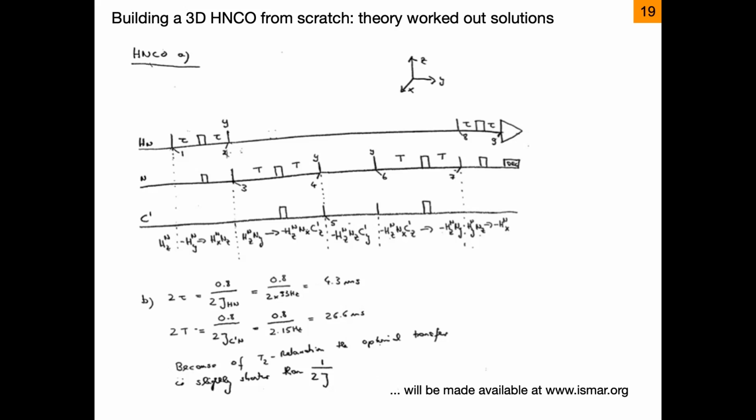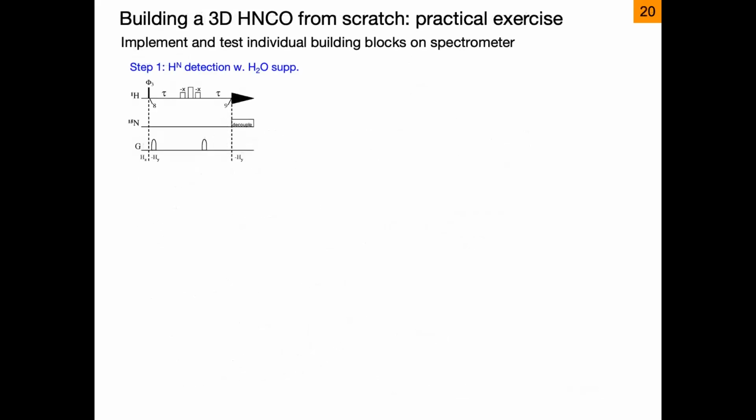And I thought this also lends itself very well to a practical exercise. And we do these practical EMBO courses to quantify all these steps. And you have also in the material that is distributed the practical exercise. We cannot do it here, but this practical exercise does all these single steps to detect your signal and compare. And so, as I said, you need a signal that you can compare it with.